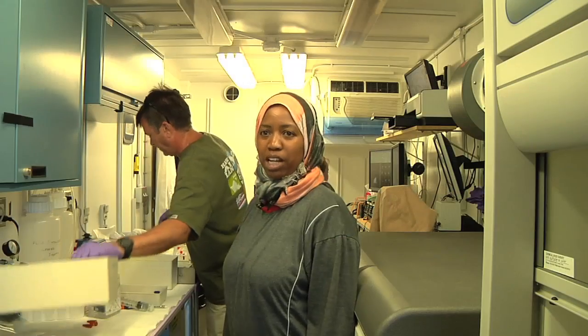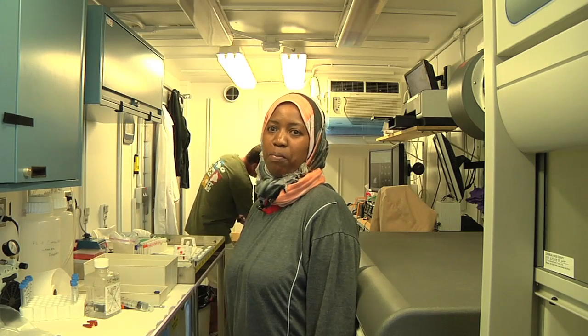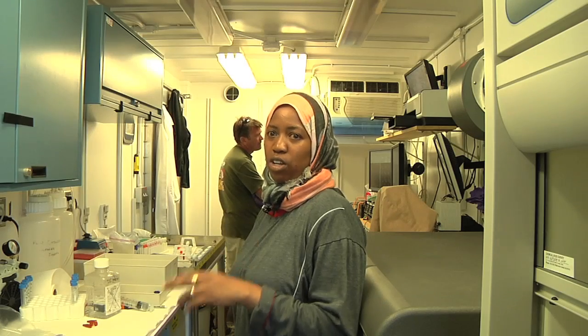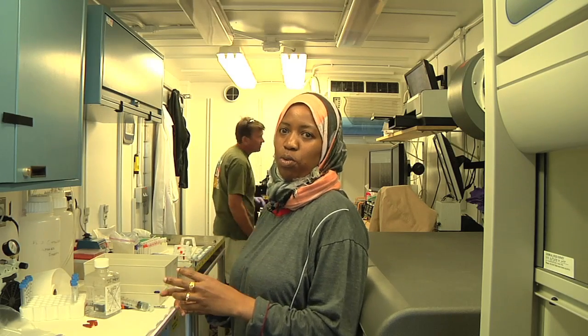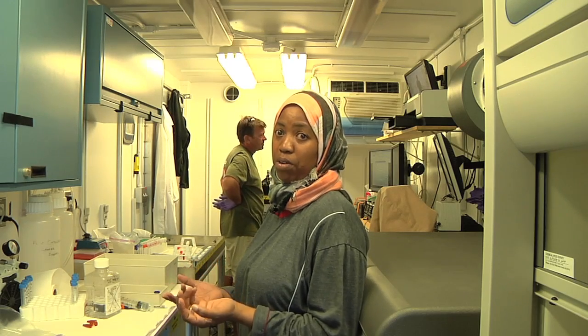My name is Maria Hamisi from the University of Dodoma in Tanzania. I'm working there as a lecturer for the time being, but I'm here as a student of the CMOR course. And I'm in the visualization part, where we are collecting samples to view in the microscope and for flow cytometry, like counting the things that we cannot see with the microscope.